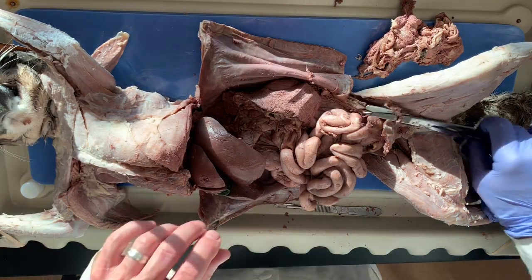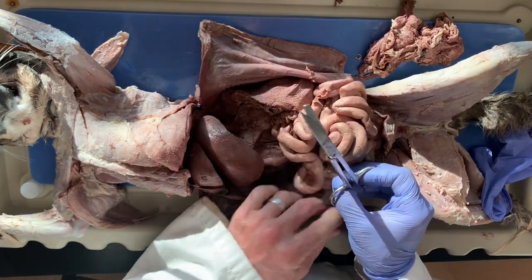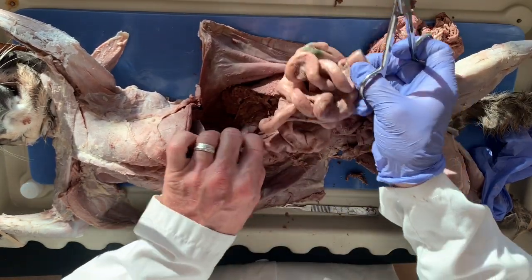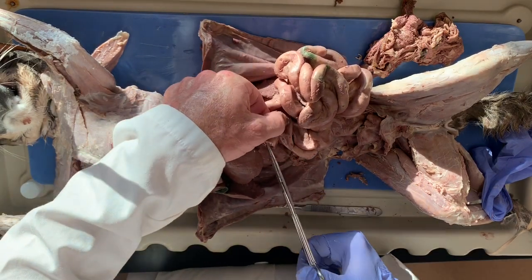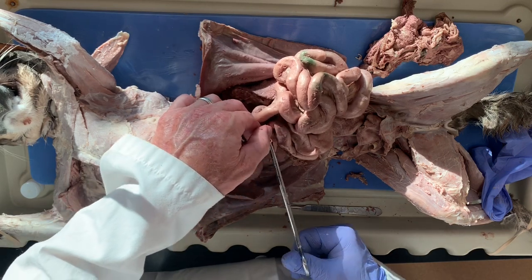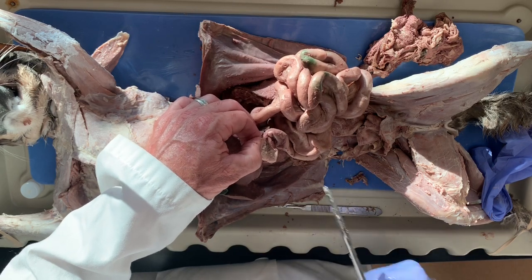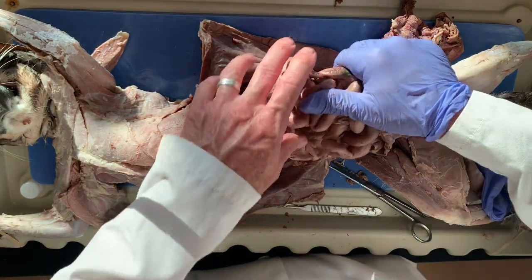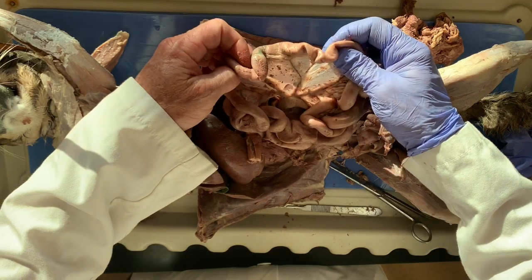So the next thing we're going to do is separate the small intestines. We already have our first cut where we separated the stomach, and that is right here. And I'm just going to put a lateral cut. Ooh, I saw some roundworms right there. You guys see that right there? So the cat had a little bit of intestinal parasites. Before I break this all apart, I wanted to show you guys this. And that's pretty cool.